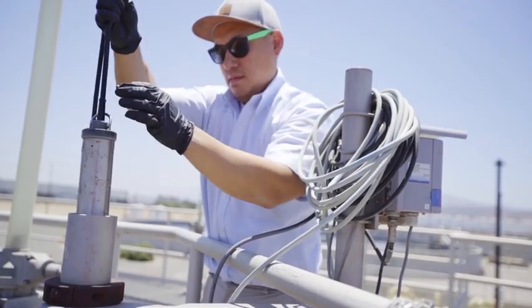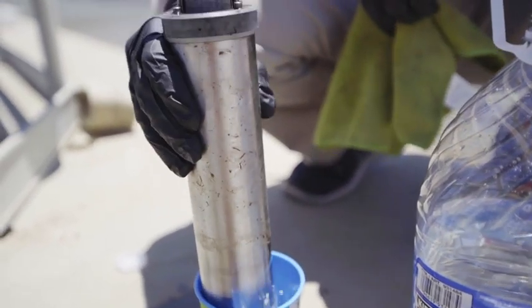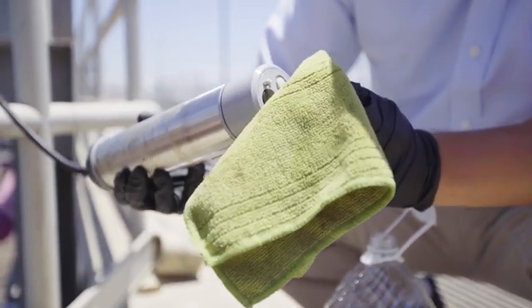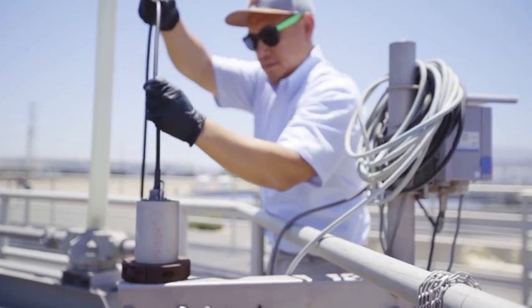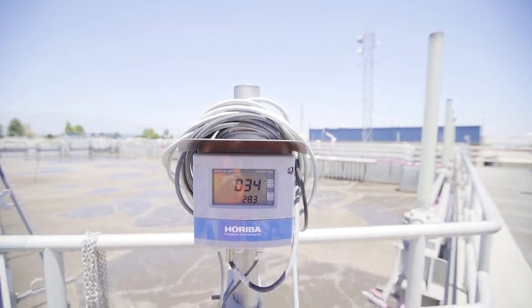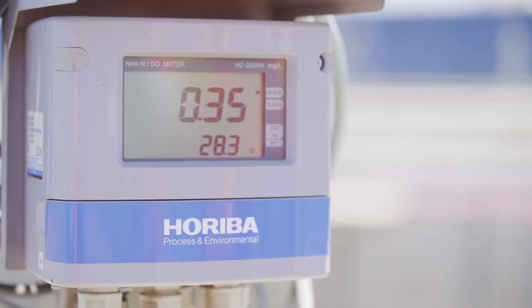The expense comes in with doing nutrient control is, in order to do that, you have to get a wet chemistry ammonia analyzer. And those analyzers are in the neighborhood of $30,000 to $40,000, where a probe you could potentially get in that $10,000 to $15,000 range. So it's a huge cost savings from an O&M perspective on not only the upfront capital, but the routine maintenance that is required to keep these things up and going, calibrated, and whatever miscellaneous consumables you may have in a wet chemistry analysis.